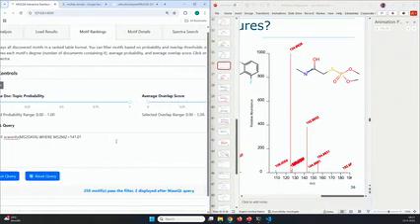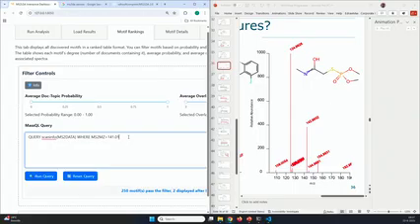But it's always the same principle. If you have any idea what you're looking for, this automated annotation guidance is really helpful, but only if you look for structures that you think are in any database. If you look for completely novel compounds, a reference database won't help, and the structural recommendations will also not help. You will still get the structural recommendations, and that does not influence how the modeling works. You can also still use the querying to find fragments you're interested in, but then you have to do it manually.